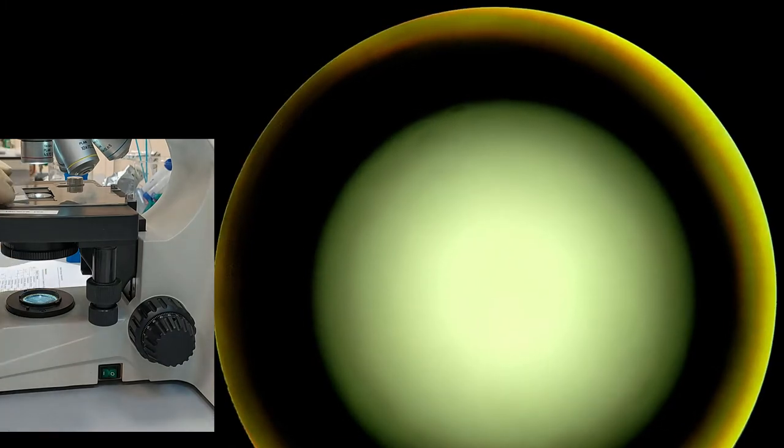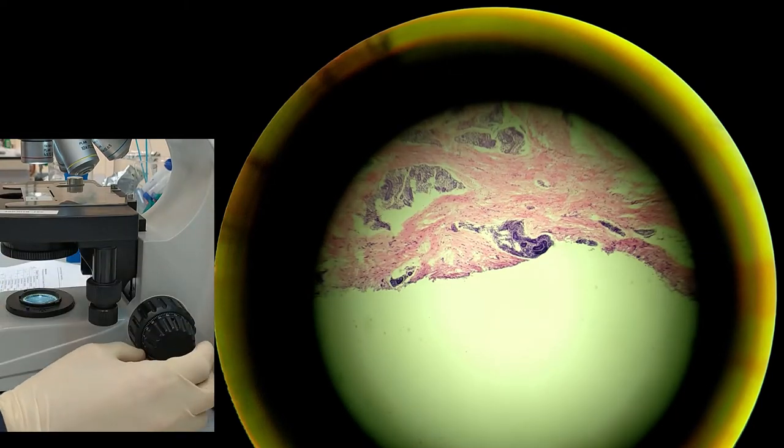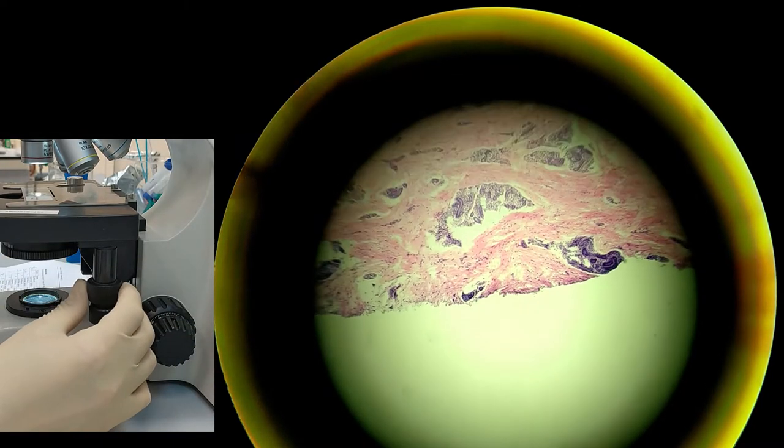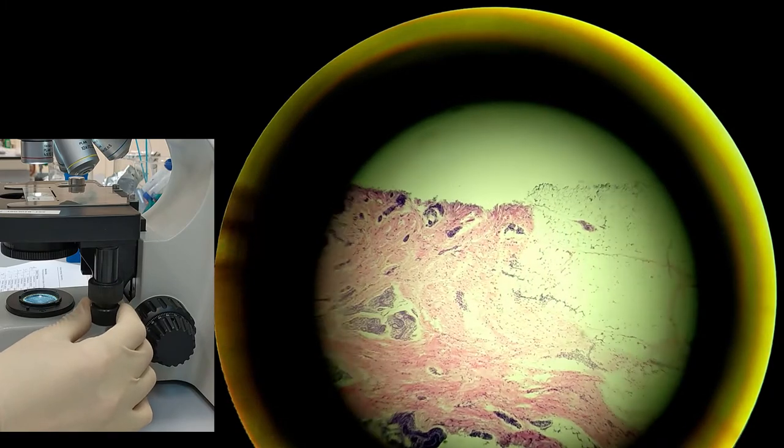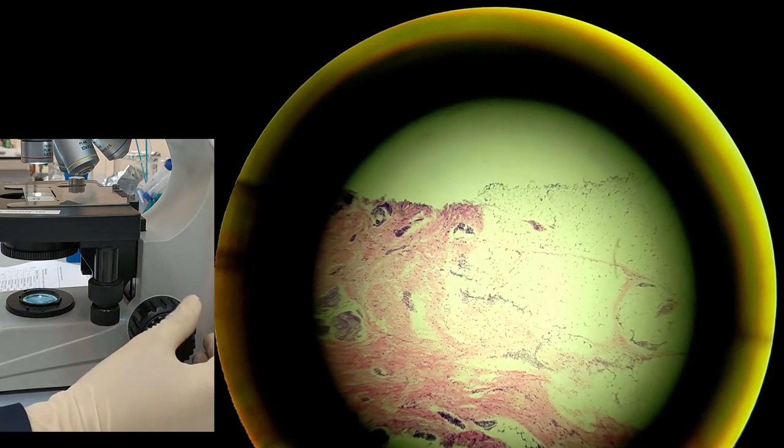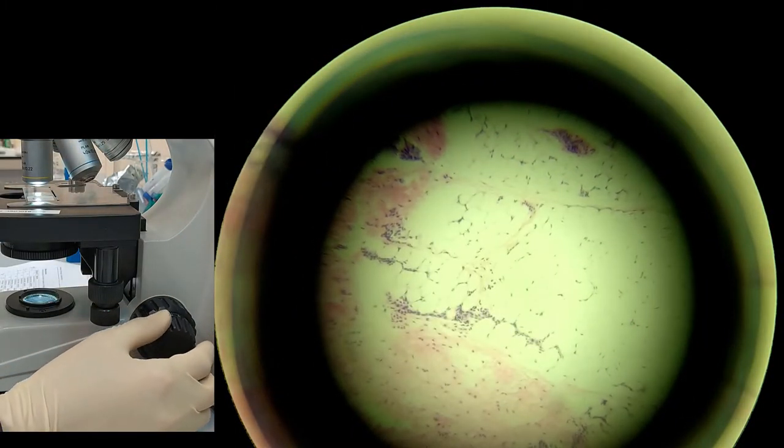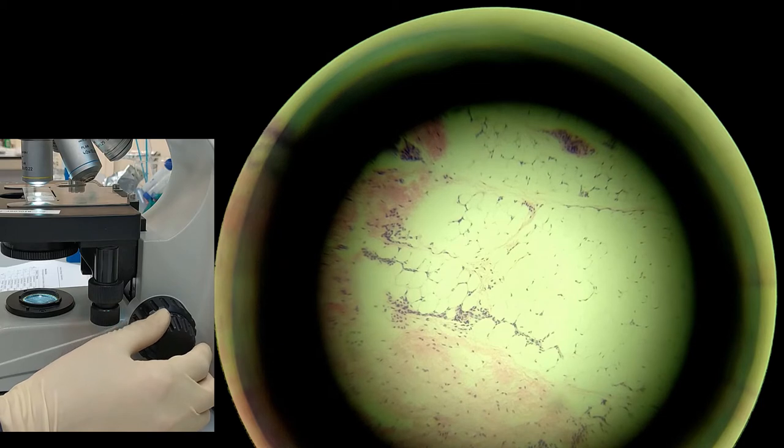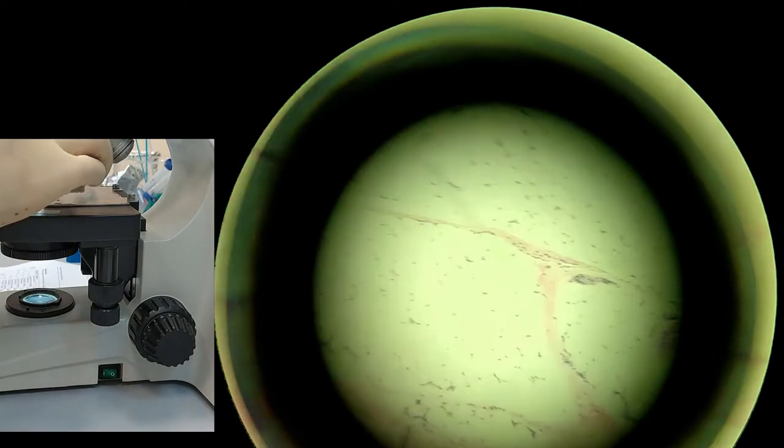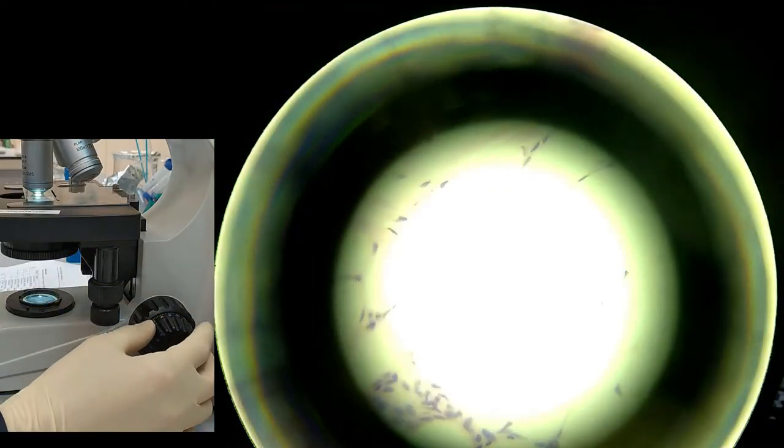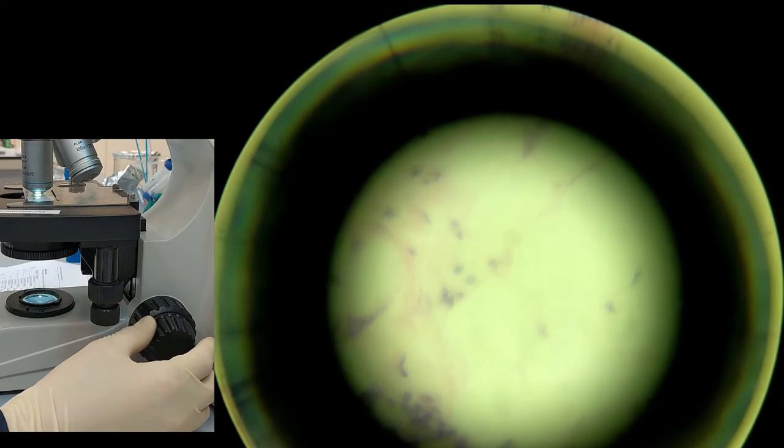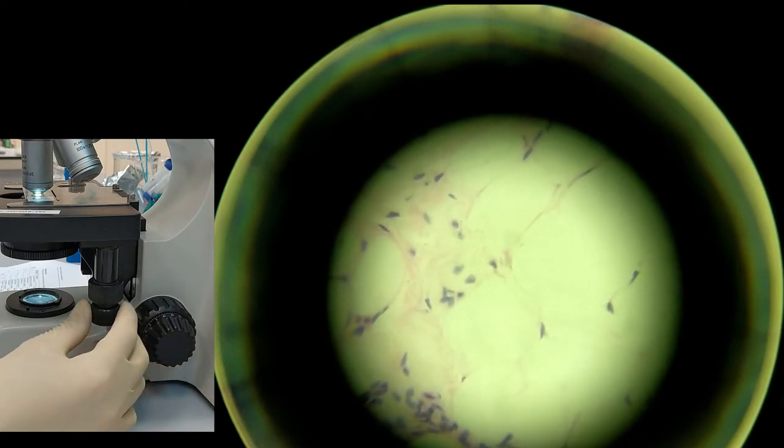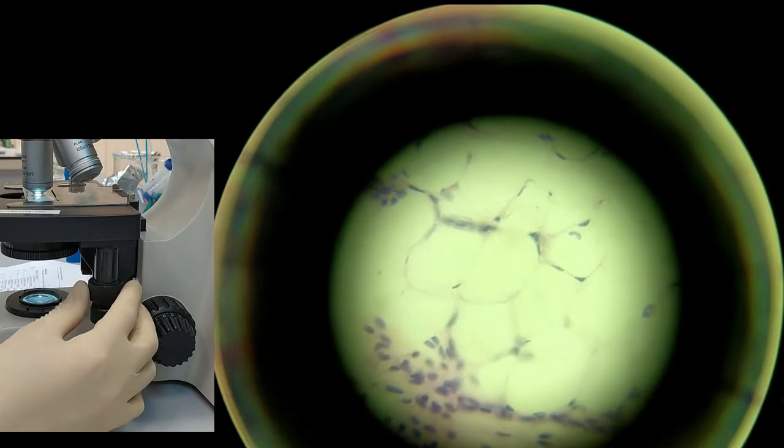Next we have adipose tissue, and adipose means fatty, so this is the fatty tissue. This is the composition of the fatty tissues. Now we switch to 10x, and you have these huge cells that contain huge bubbles and these bubbles are filled with fats. Find the best view for yourself and start drawing.